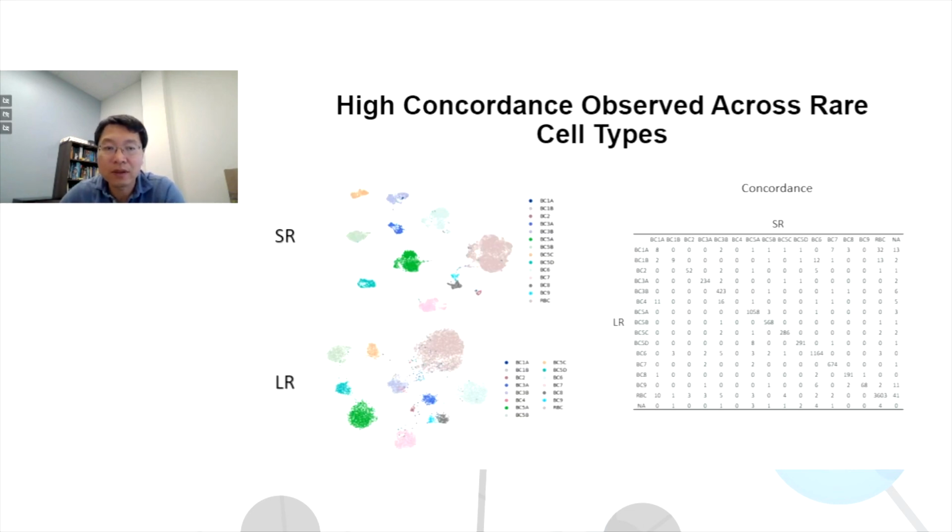Right. So not only can they look at the cell class level, but when you zoom in, remember some of that will come from rare cell types, for example, bipolar cells. Bipolar cells together account for roughly 10% of the cell population in the retina, and they can be divided into 15 different types.